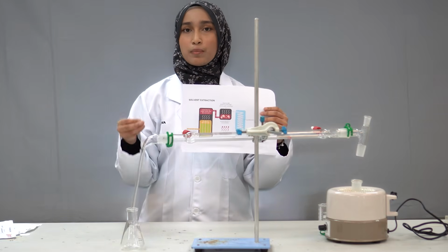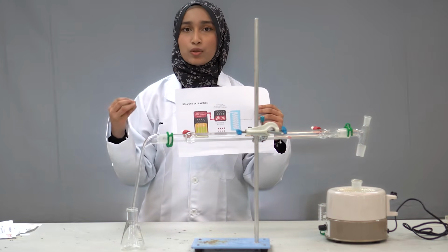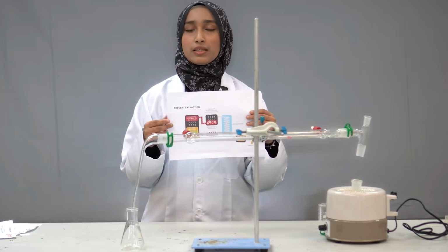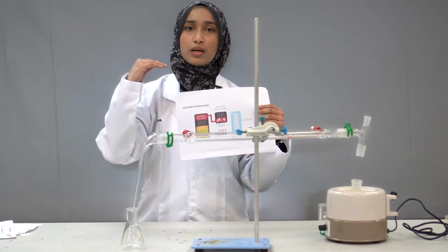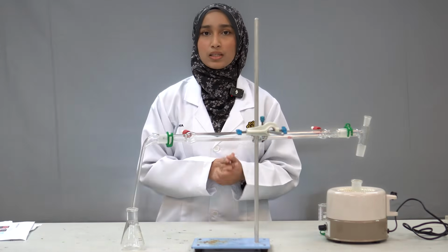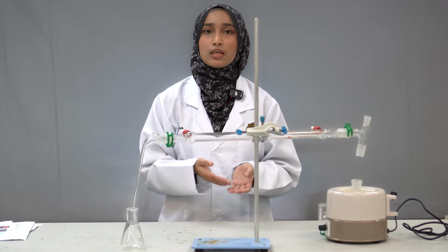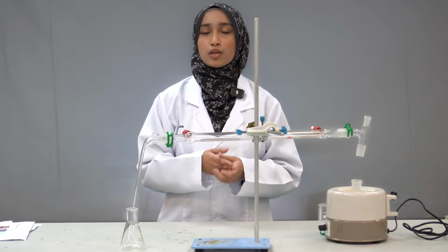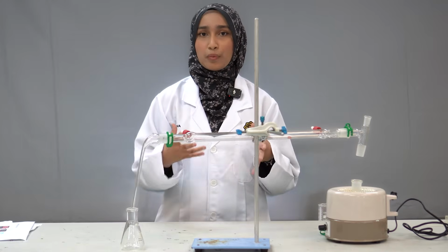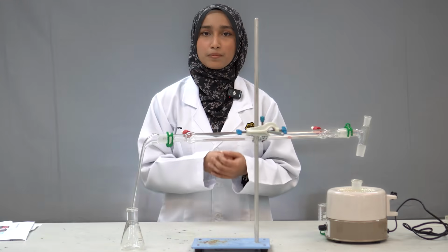So the vapor mixture of steam and oil will then pass through the condenser, where it is cooled down and condensed back into liquid. This condensed liquid will have two distinct layers, which are the aqueous layer and the oil layer. The oil layer, being immiscible and less dense than water, will float on top of the aqueous layer and will be separated using the Florentine flask or oil separator. This method is widely used to obtain natural flavor extracts such as lemon, rose, and vanilla oils, which are used in perfume and also the food industry.